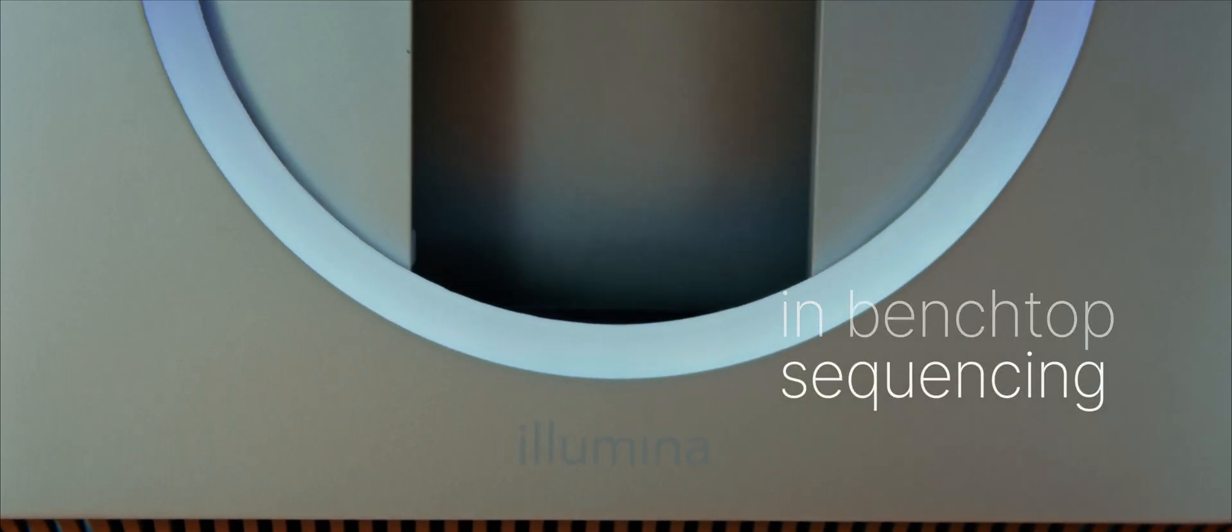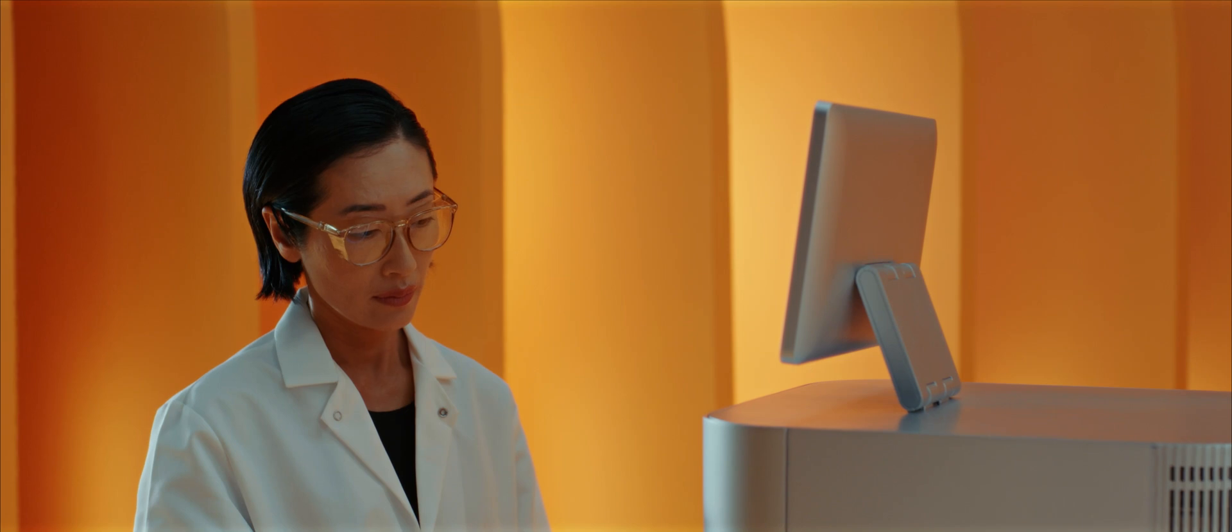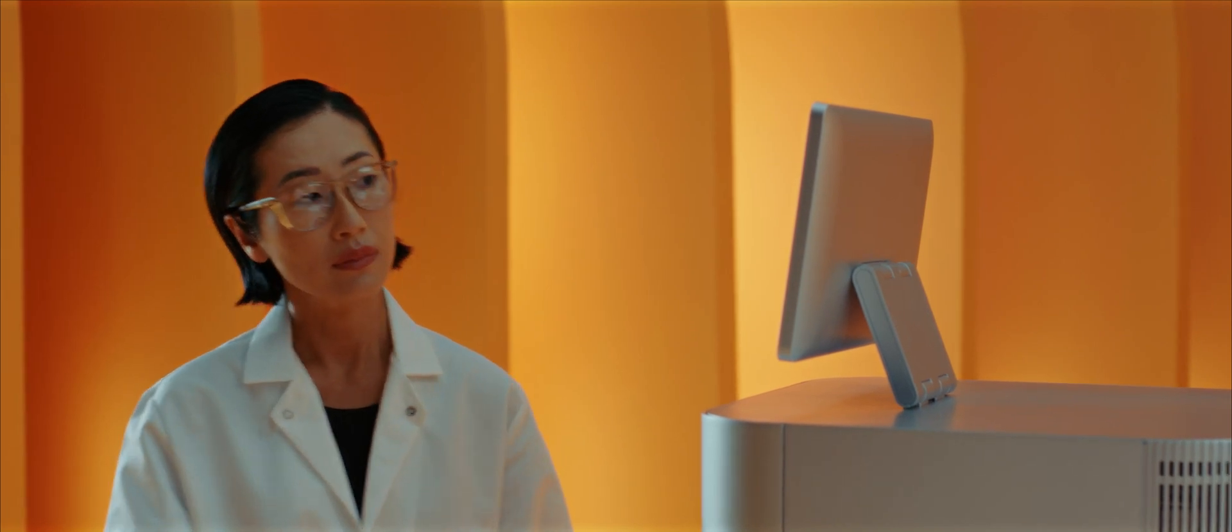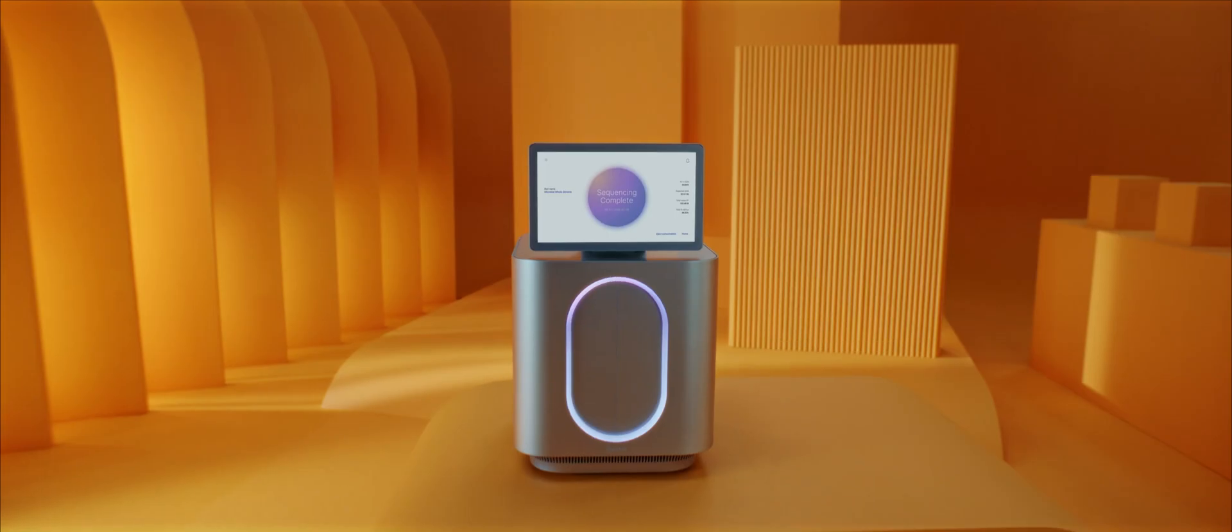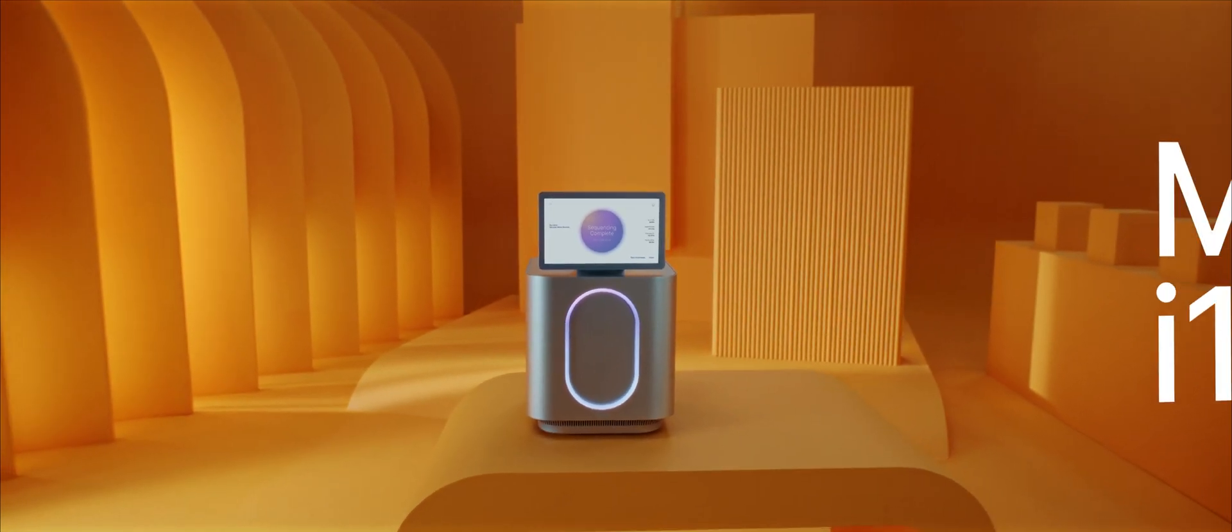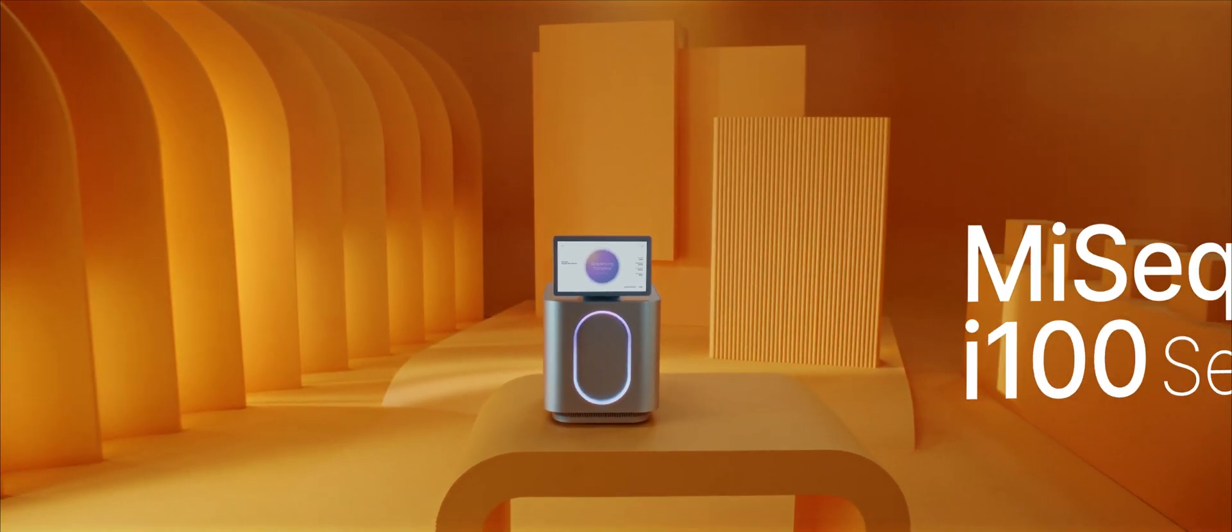This is the highest standard in benchtop sequencing. This is sequencing for every lab. This is the MiSeq i100 series.